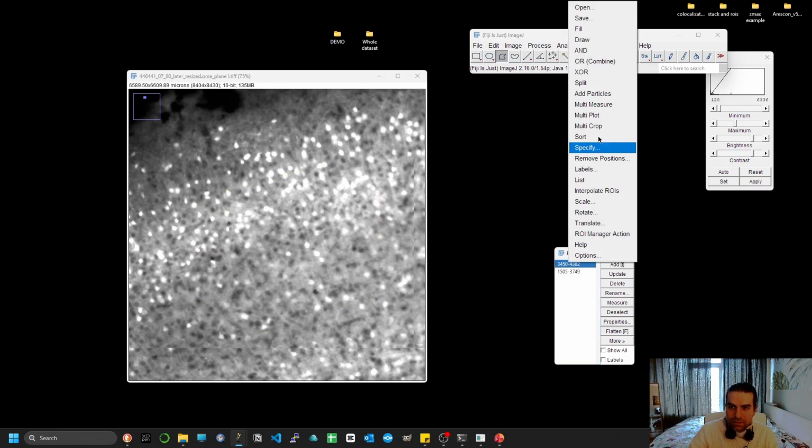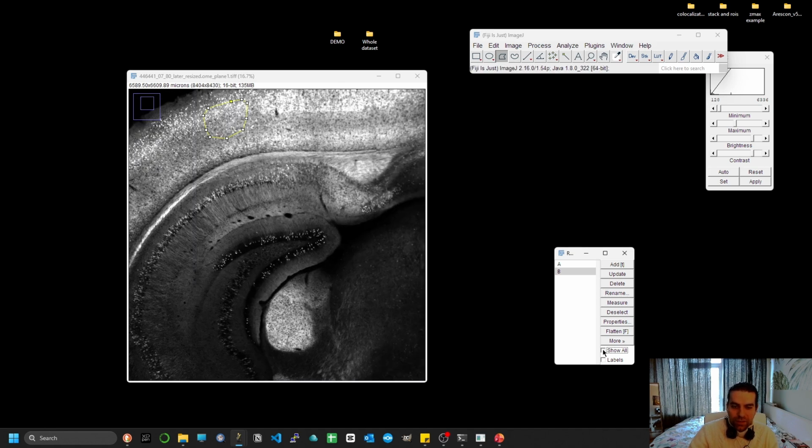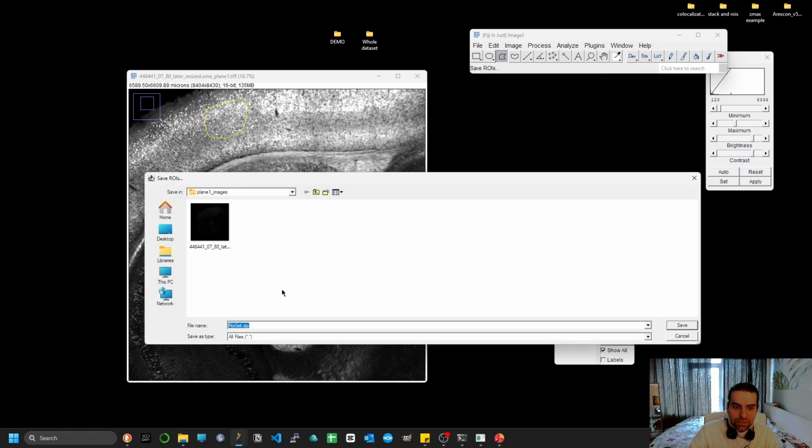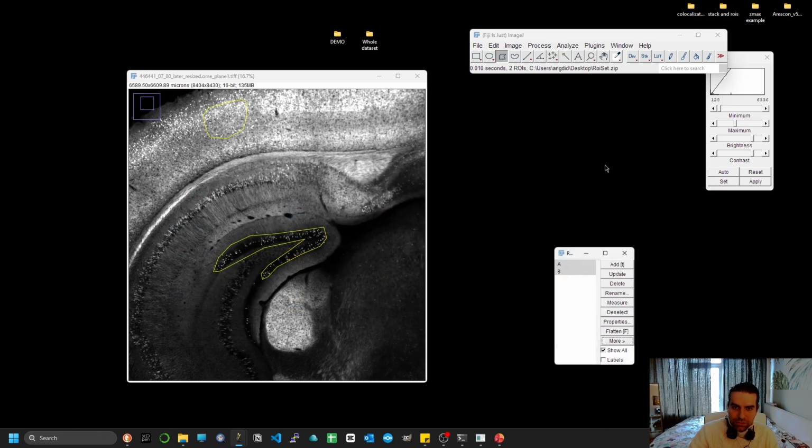And let's name this region A, and let's name this B. And you can have as many as you want, of course. So I'm going to save both of them. Let's save them on desktop. I'll have to change the name though.